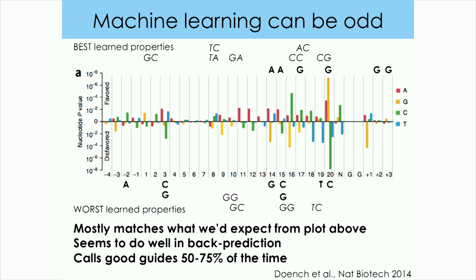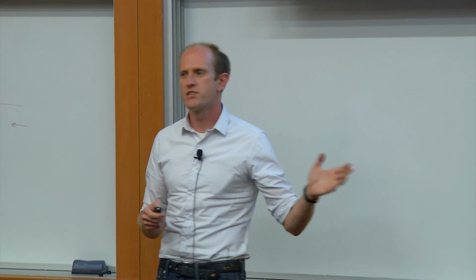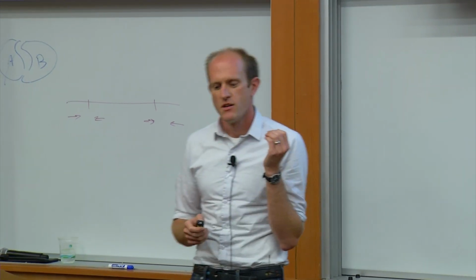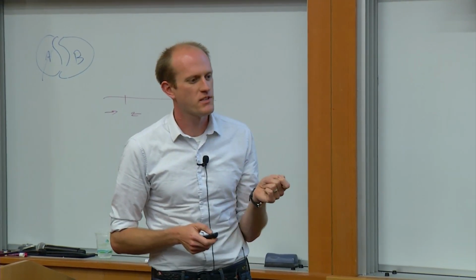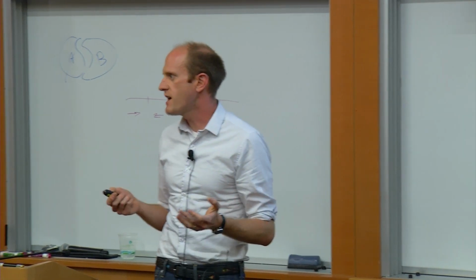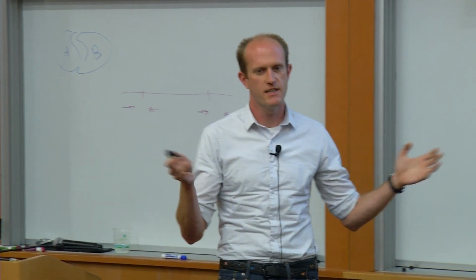So they compared it back to the Lander-Sabatini screening data, and they were able to sort of post hoc pick which guides worked and which guides did not using this training set. But this is now something kind of important for machine learning. This becomes sort of a magic number set, right? You can't go in and change any of these numbers because these numbers work magically together.